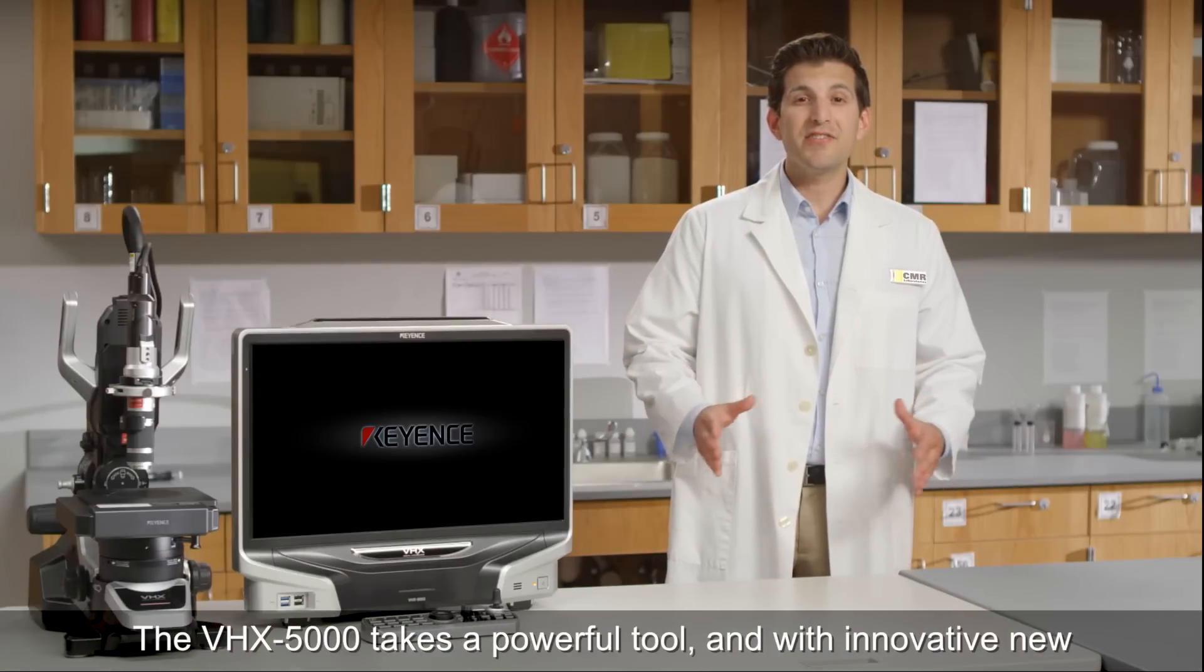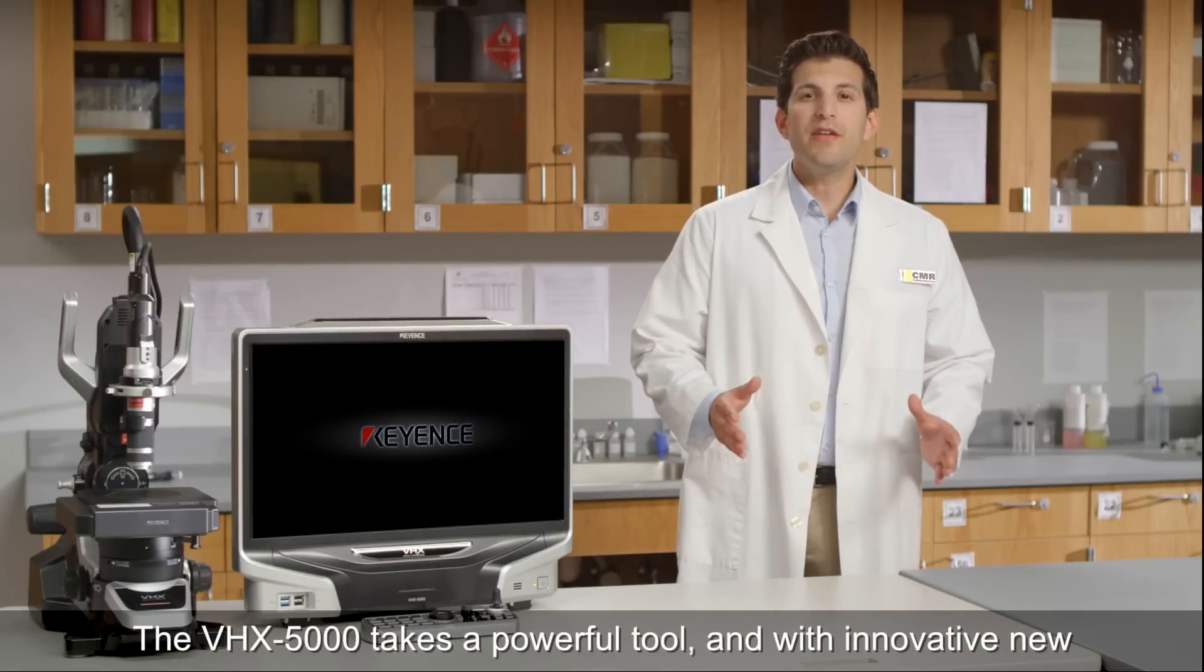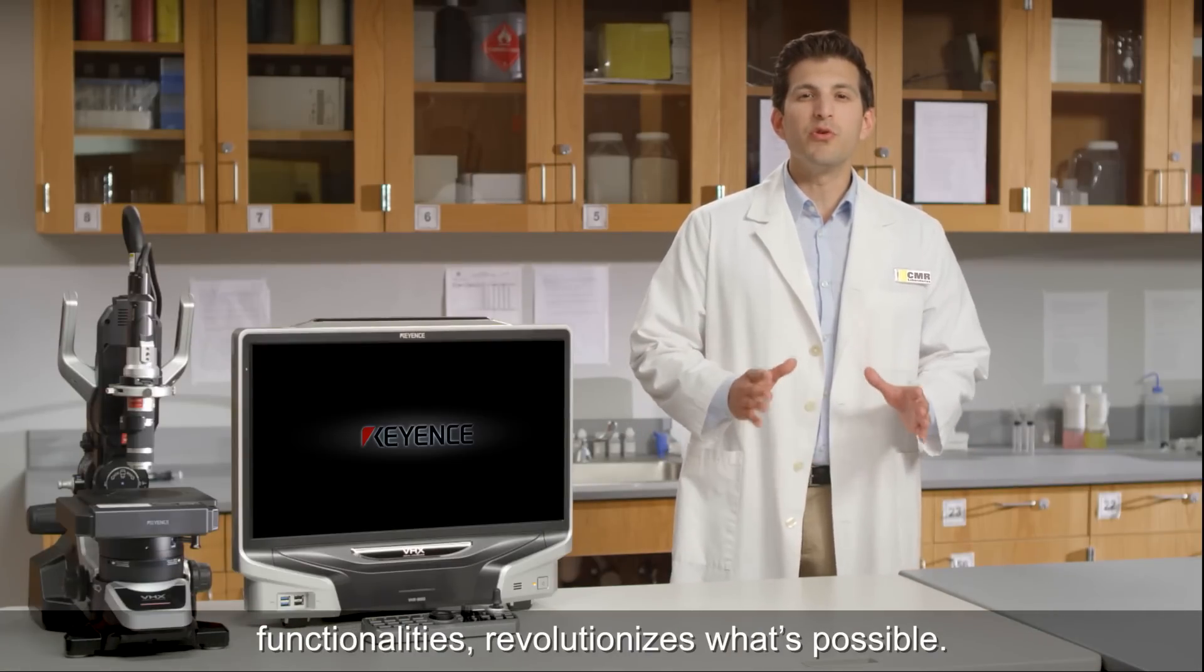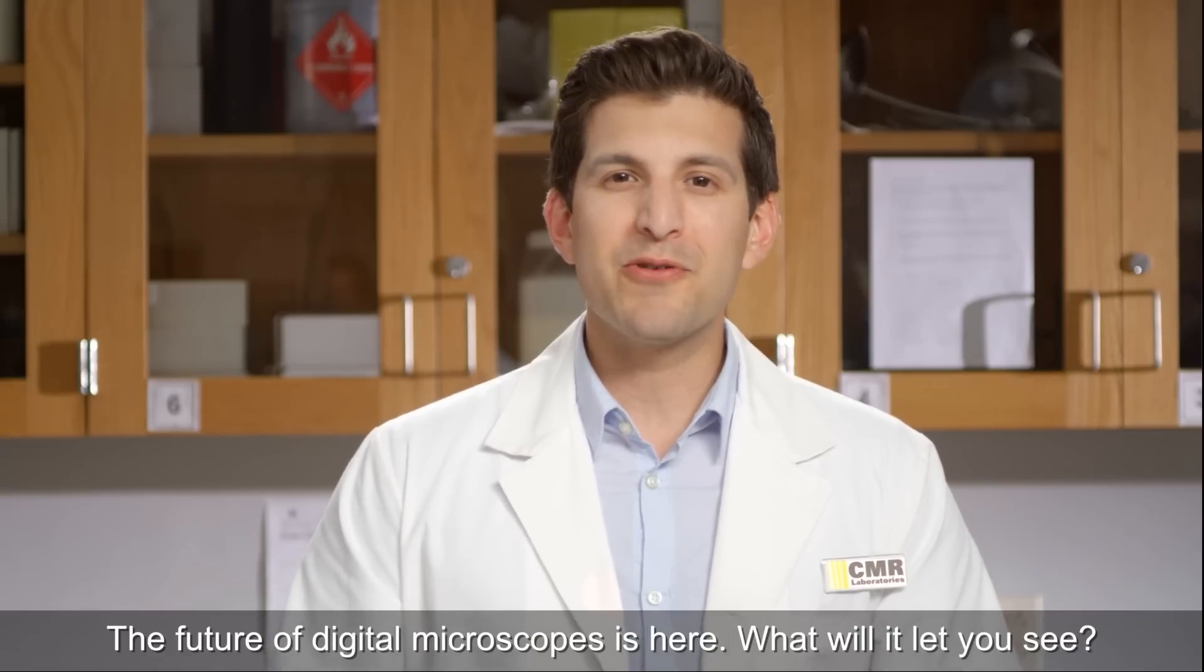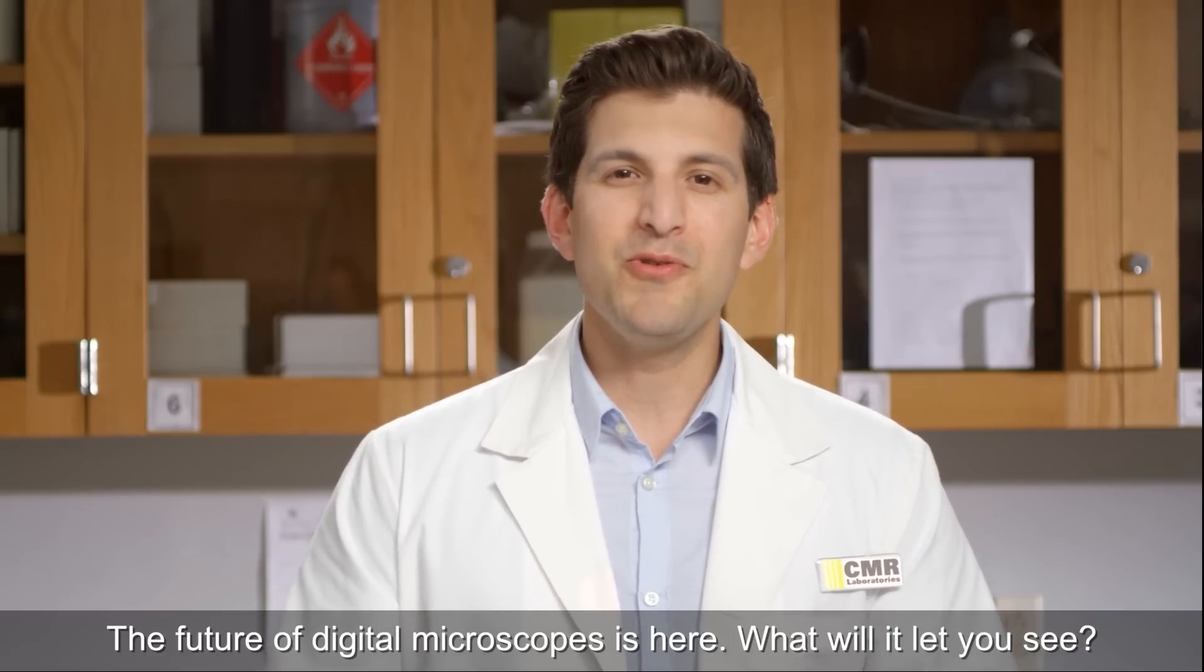The VHX5000 takes a powerful tool and with innovative new functionalities, revolutionizes what's possible. The future of digital microscopes is here. What will it let you see?